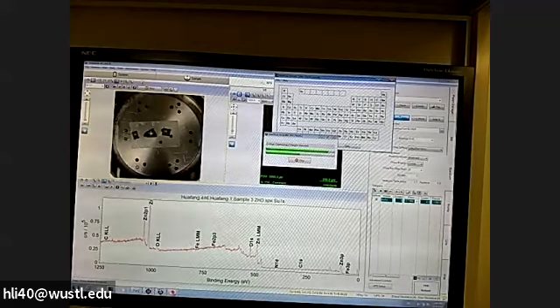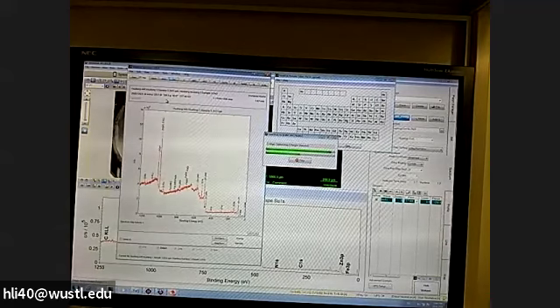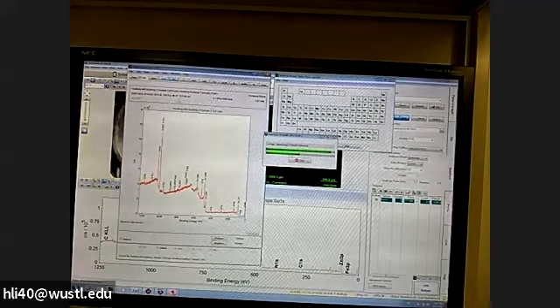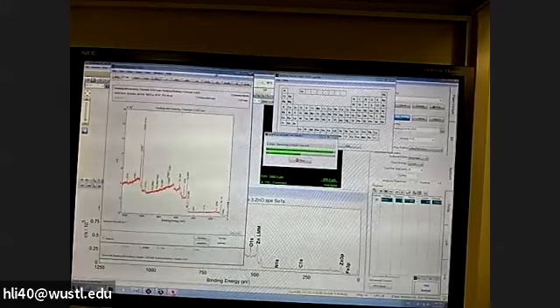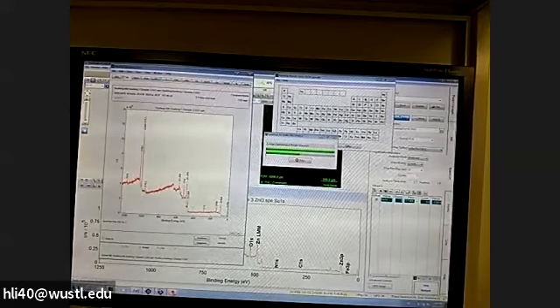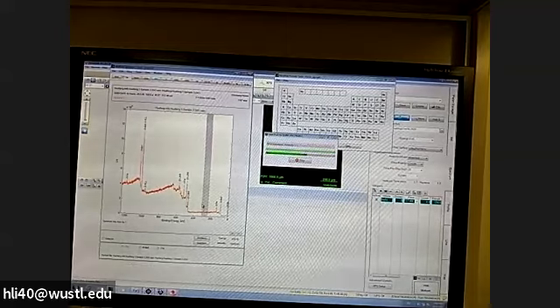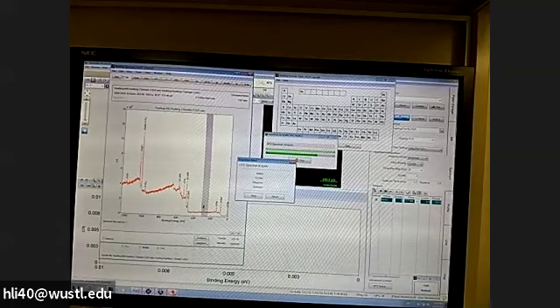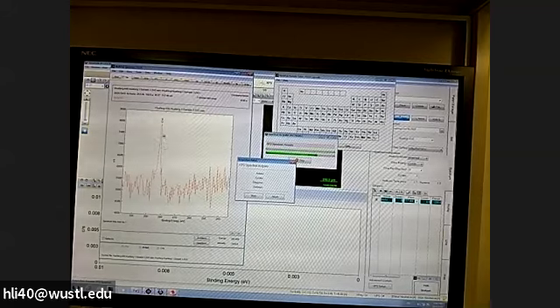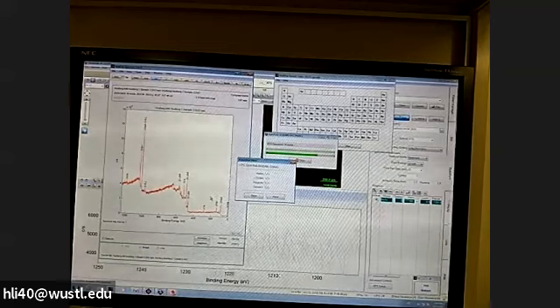All right. So this is the analysis software. You can do quantification. You can do this ID. If I don't have iron or nitrogen, I don't need to put them on. You can zoom in: just left click and drag and slide the mouse, and you will zoom into this peak. It's very noisy because we only did 2 sweeps, and it also has a large step size.